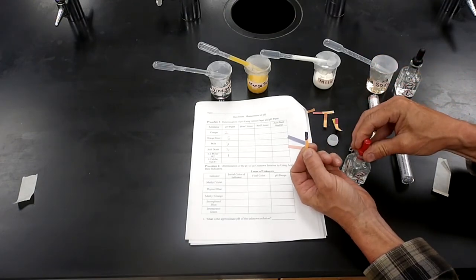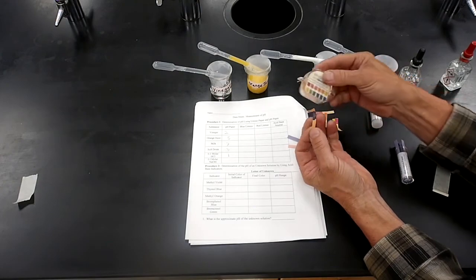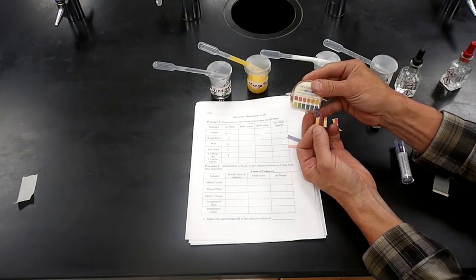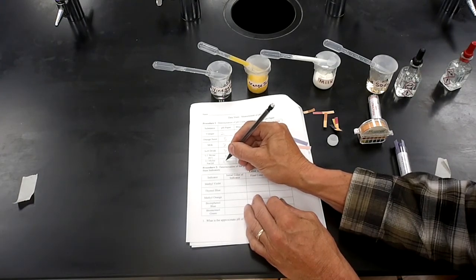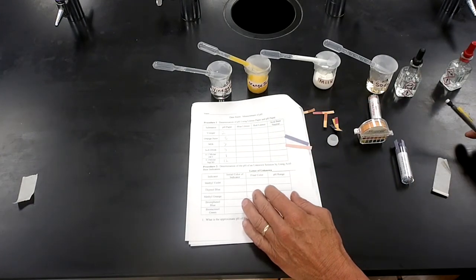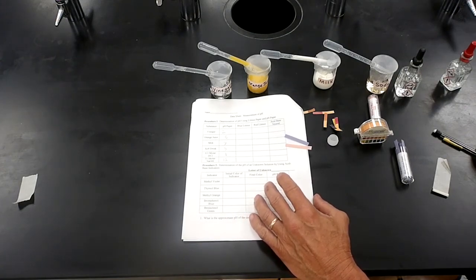Whoa, look at that. That is very blue. I'm going to call it 12. Sodium hydroxide is the main ingredient in drain cleaner, which has a very high pH.